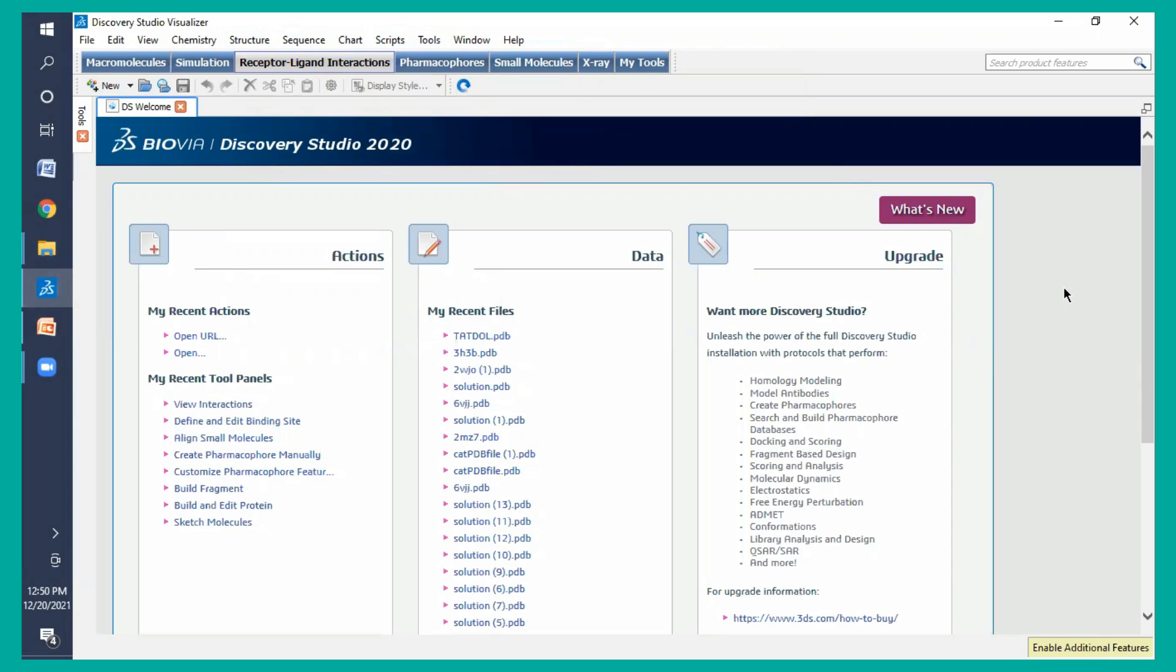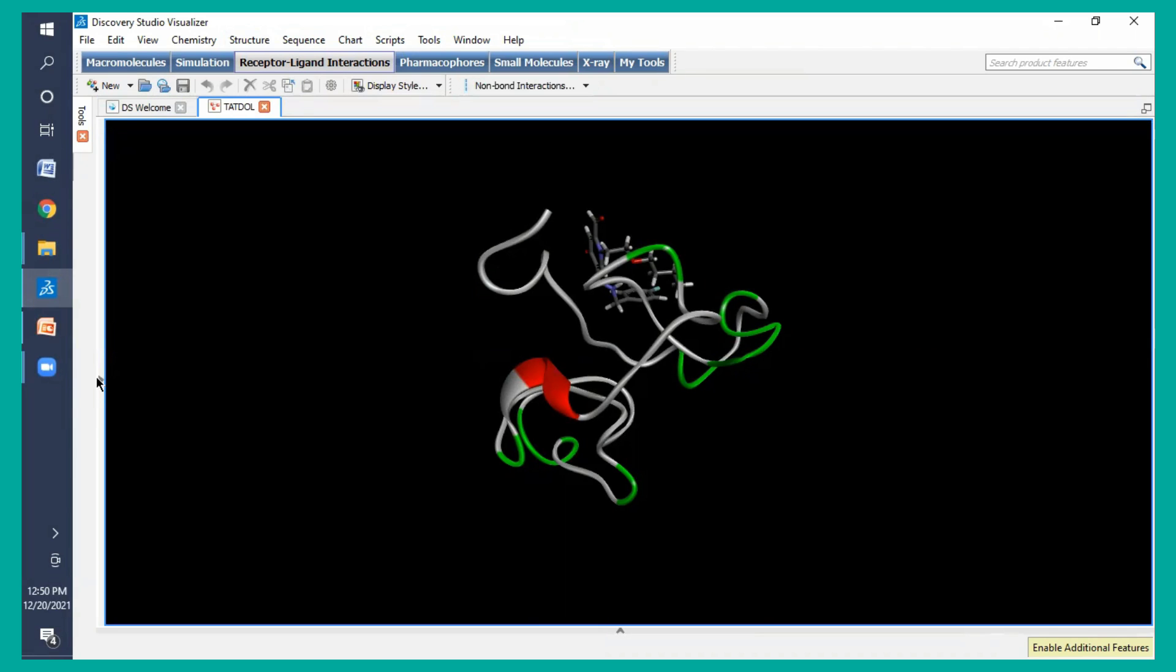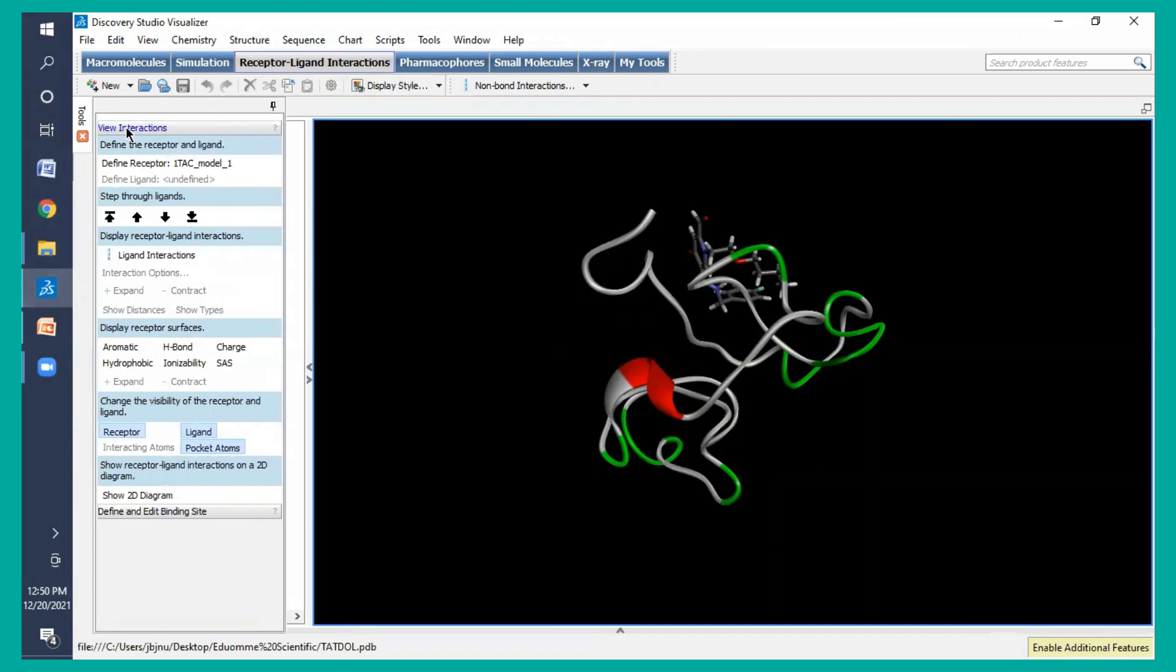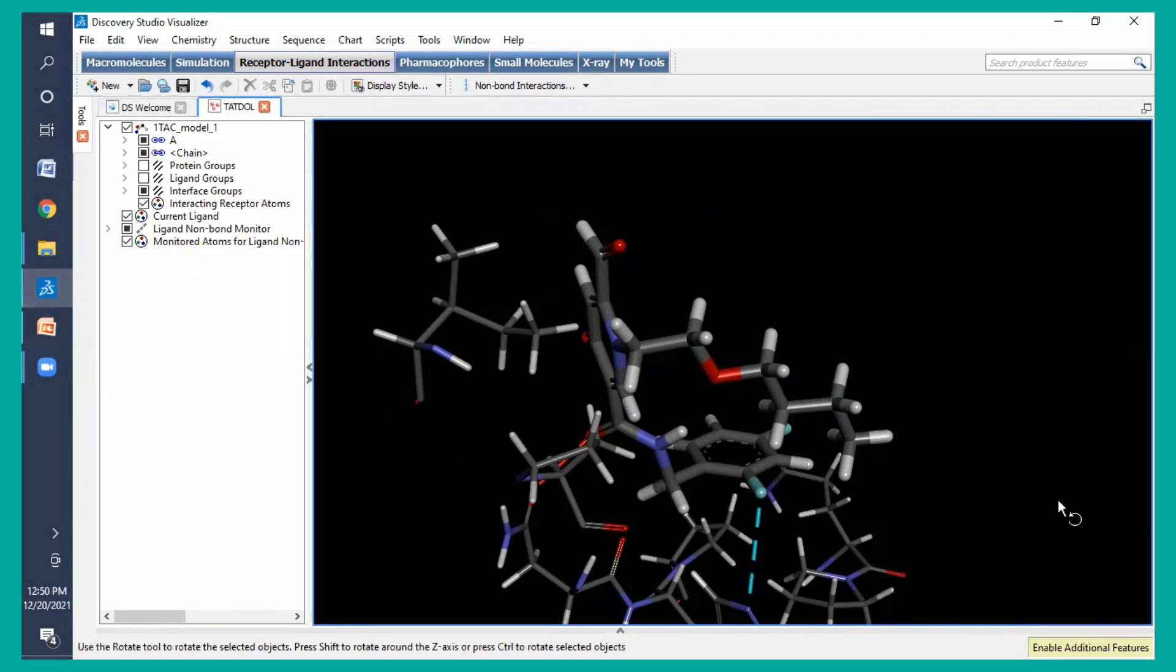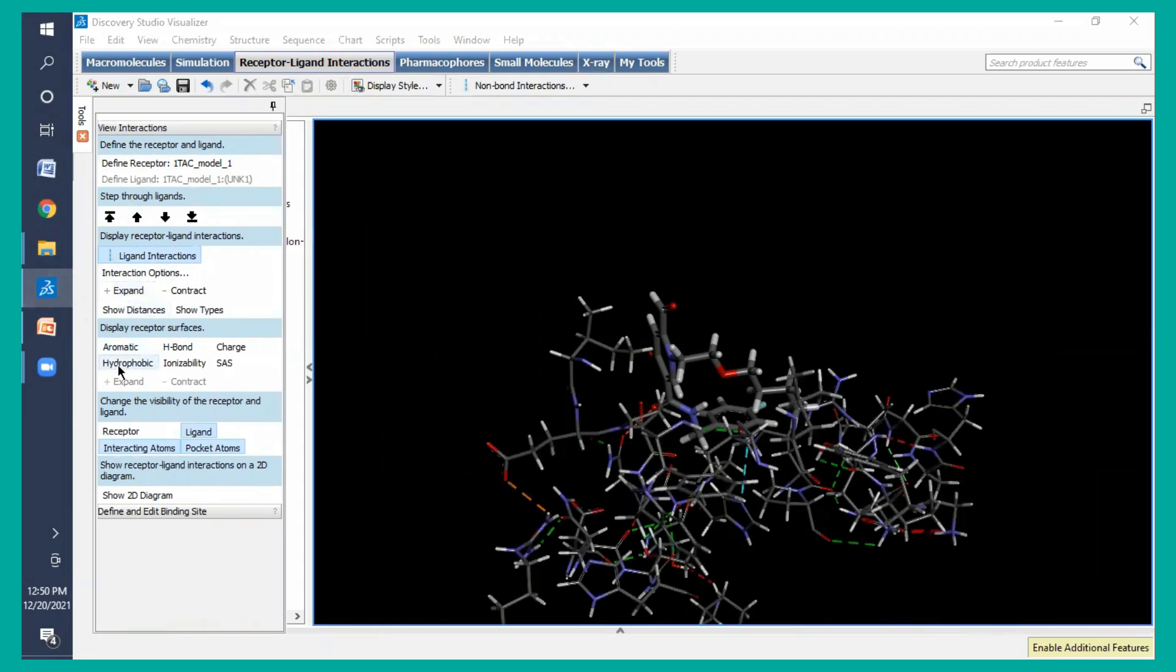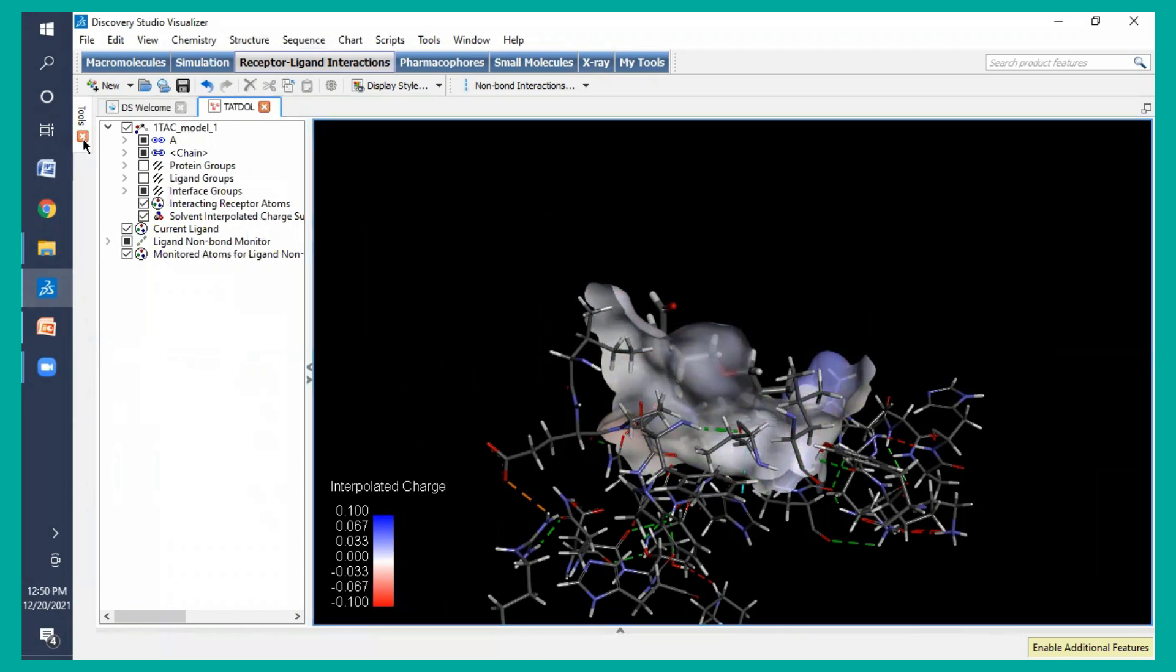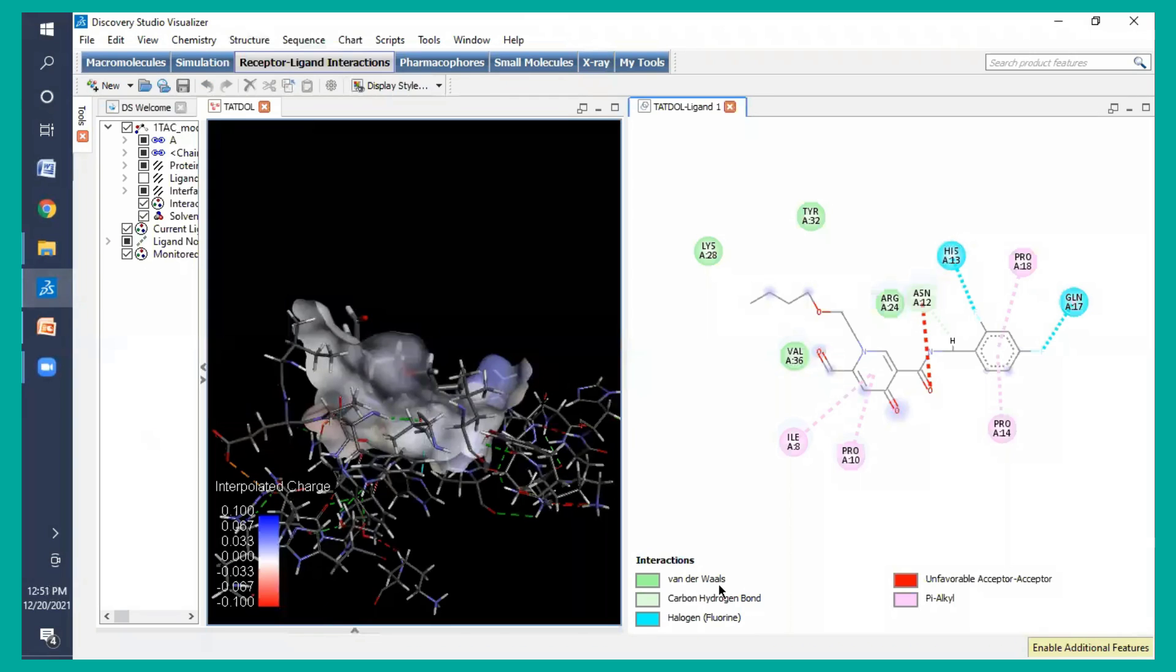One by one, I will teach you all these things in upcoming videos also. But for time being, let's see what I have shown you. Either you can click here, this H button, or you may click this control and H button. You will come to this platform with all these details. You may go to this section. You can check the interactions. From here, you can check all these things. You can either expand these things if you want to check hydrophobic bond, hydrogen bond, charges, all these things you can utilize from here. And if you want to get the 2D interactions also, you will get here, along with the description about which kind of bonds are present here, like van der Waals or these kind of things.